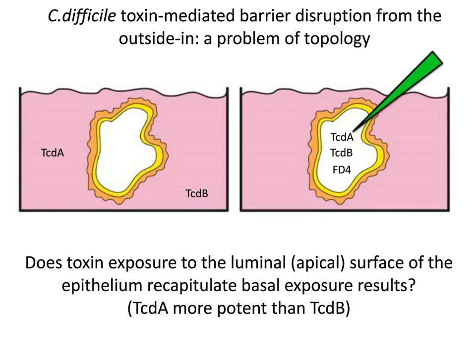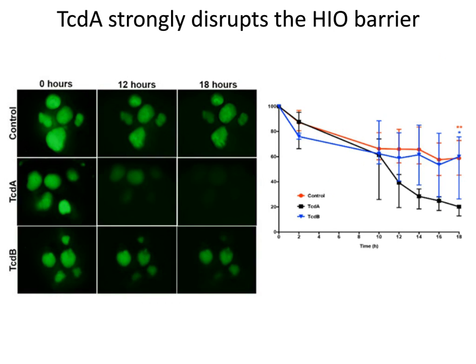into the organoids. And so we really wanted to refine our assays and develop a new assay where we could micro-inject things like toxins and this fluorescent dye into the middle of these organoids. And so we showed that we were able to recapitulate the results of just dumping these toxins on the outside of the organoids, in that the control organoids really over time seem to maintain it nicely. So now it's the opposite way around.